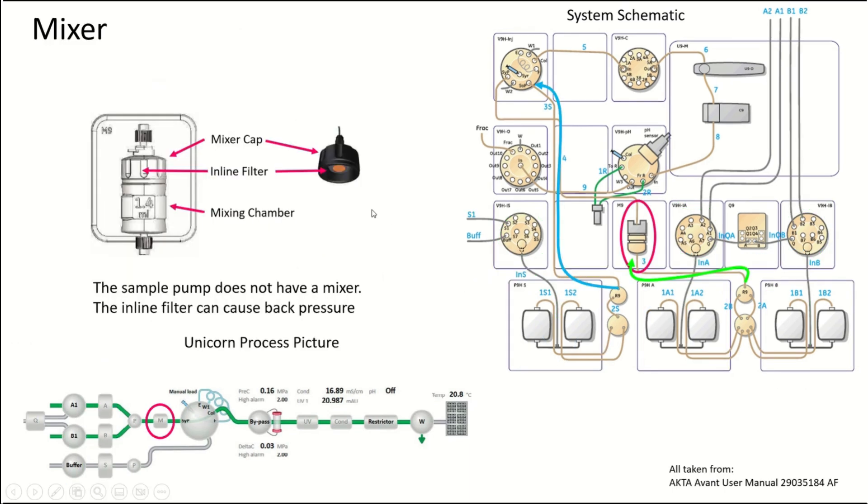After that, the mixer has an inline filter in it, which is kind of hidden in the mixer cap. A lot of people I know never even change the inline filter. You should regularly change the filter. If you're not, you probably don't even need the inline filter, especially if you filter your buffers and samples before you put them on the system. Check on that if you haven't ever. It can cause a lot of back pressure, the inline filter.